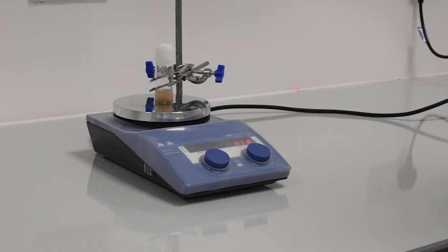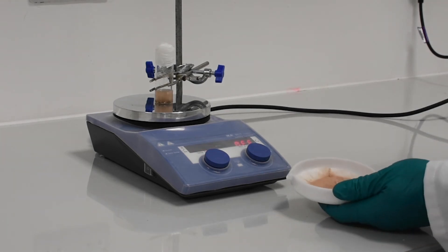The artificial sea was then filtered through filter paper. In true Blue Peter fashion, here's one we made earlier.